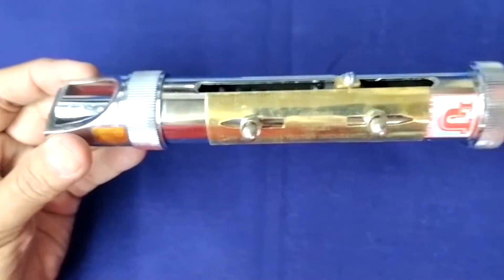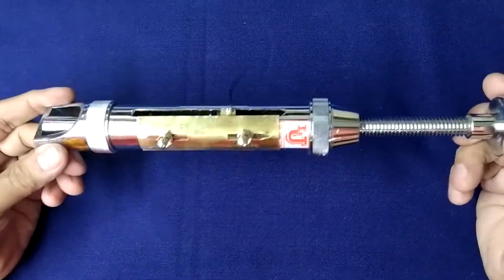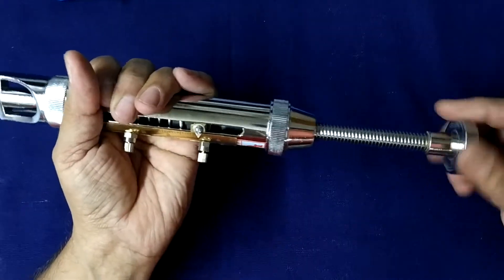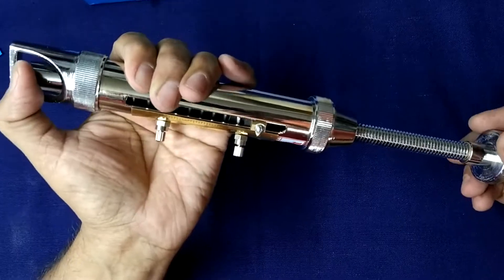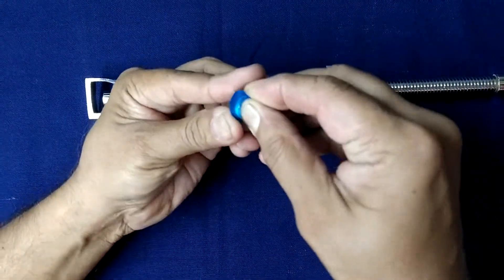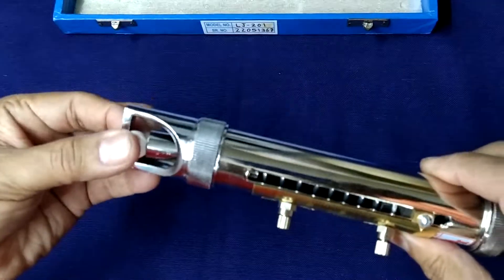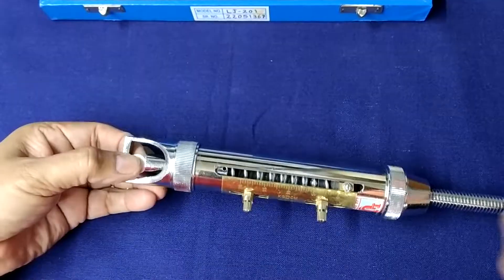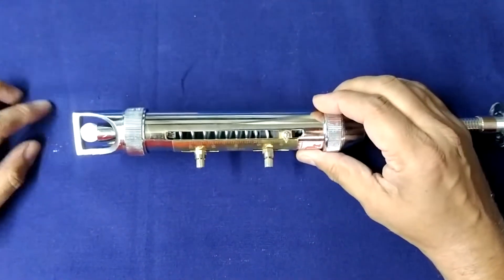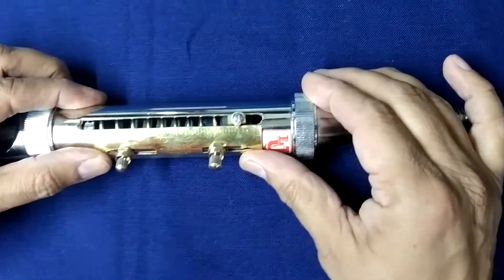This is our hardness tester. First you loosen this. This is a 12 mm tablet. You fix it in place like this.